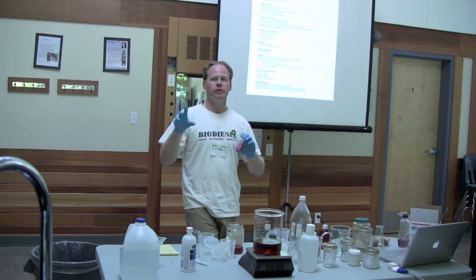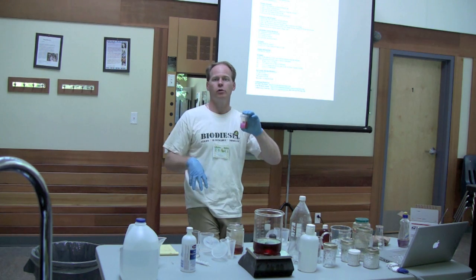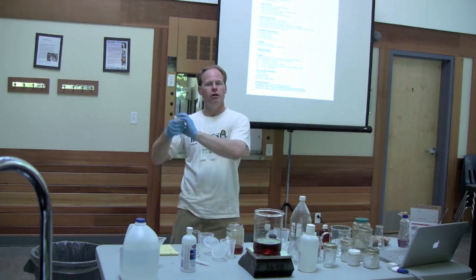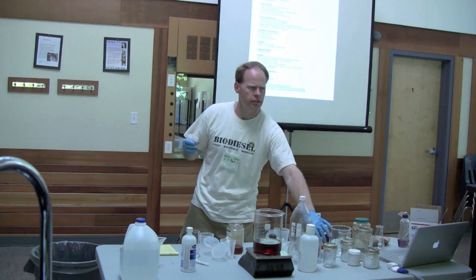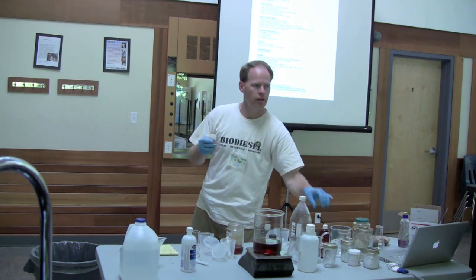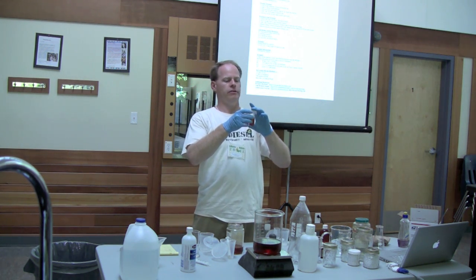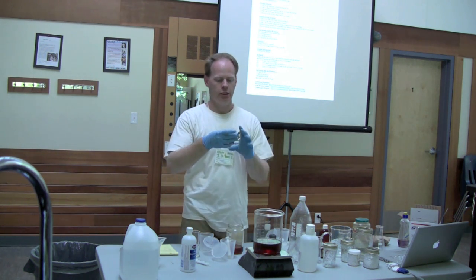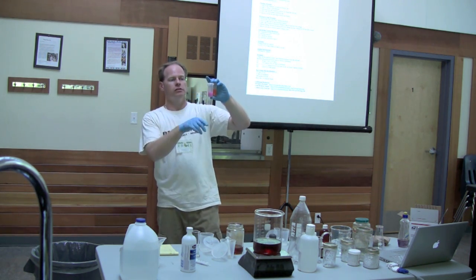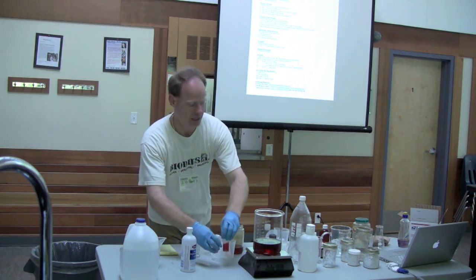I will say that if you leave it in the sun or in the heat, because it is dissolved in some isopropyl, that'll throw it off. So keep it in a cool, dark spot. You see this, I think he said this was a couple years old? Yeah, it is. It still works, but I wonder how it compares to new phenol. That's true. I don't have any new phenol. When I did the test with my new phenol, though, these were really close. So it could be that it may be going bad.